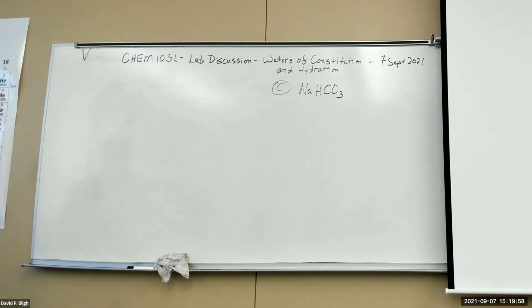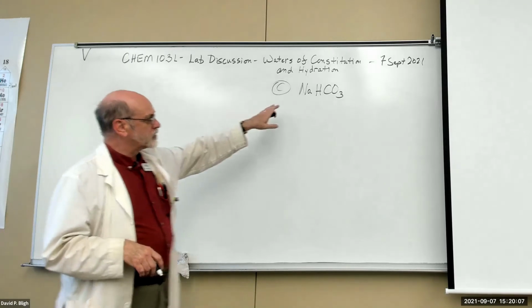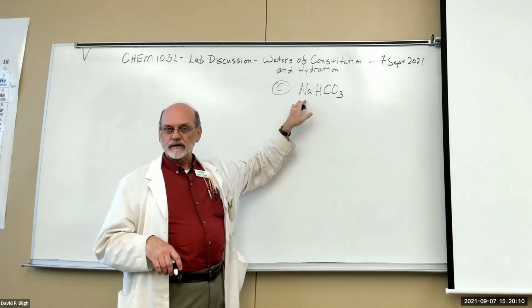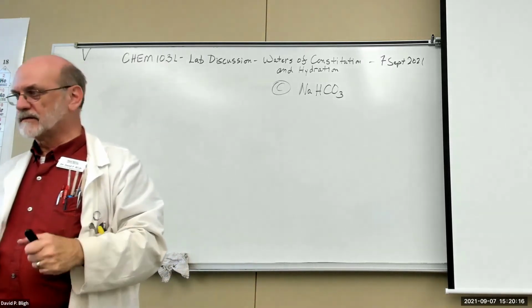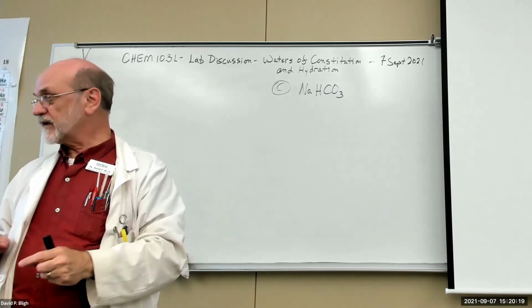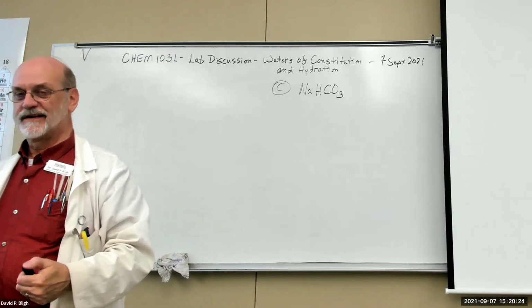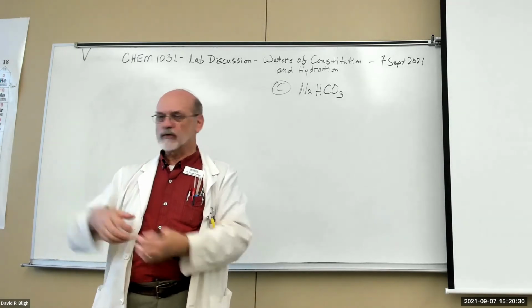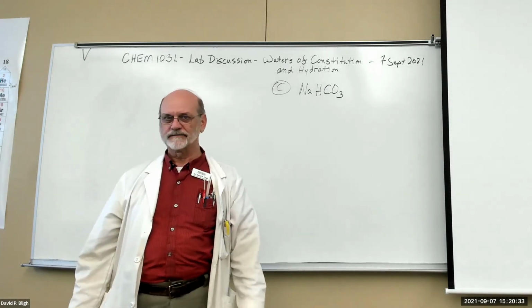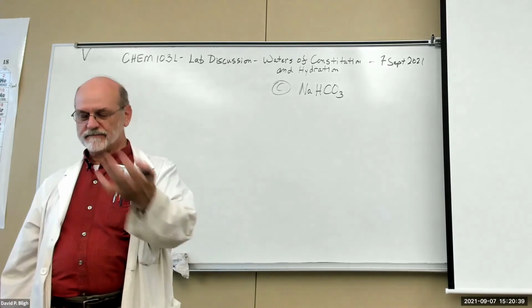Part 2. All right. I probably shouldn't have erased all that, but be that as it may. You're going to do the same type of experiment here. Only, by the way, that pretty blue color you start out with, when you get finished with that one, it's gone. It's a white, crusty powder. The water in that crystal structure is what gives it the blue color. Get rid of the water, it's nothing but a white powder now. That's how you know that you completed the burning process.